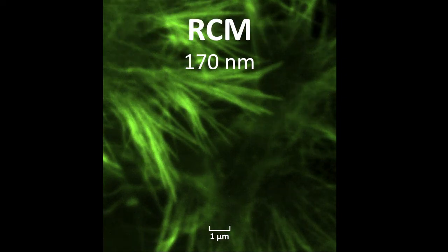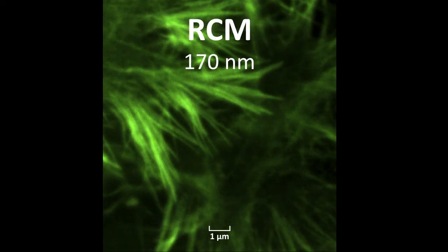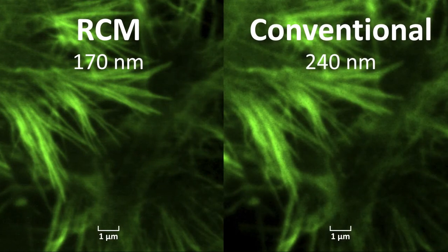The RCM principle is optics only, so there's no software post-processing needed to achieve the improved image resolution. If we combine this with a sensitive camera detector, the RCM has a 4 times higher signal-to-noise level. Concentrated light without closing the pinhole.